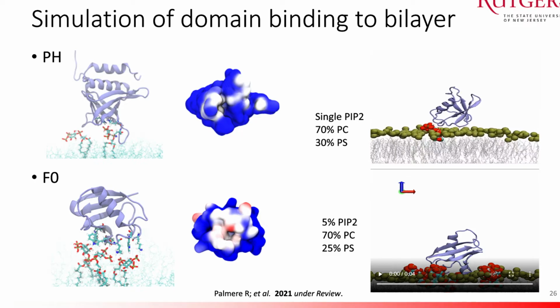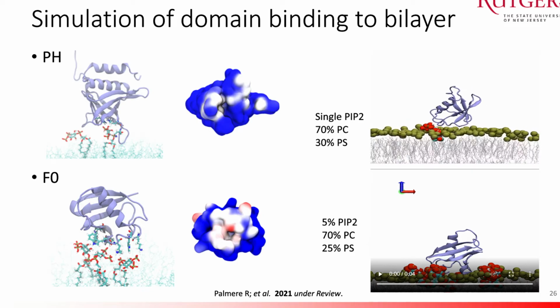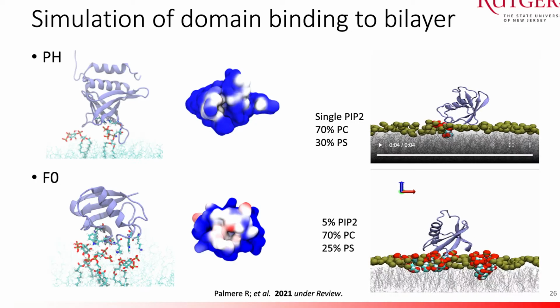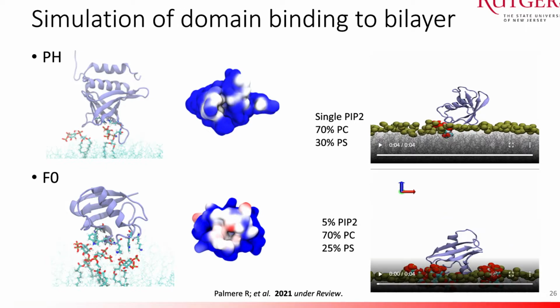Is a much less than static situation here. So this actually spends a lot of time bouncing around on the membrane. So the PH domain maybe not quite so much, but the F0 domain very clearly falls over, and I'll show you some quantitative data about what that means later, and exposes this helix, which is interestingly a huge source of protein-protein interactions. So this helix going from a vertical, maybe hidden, to a horizontal, less hidden interaction could very well be an interesting, real biological phenomenon that we're actually looking into.